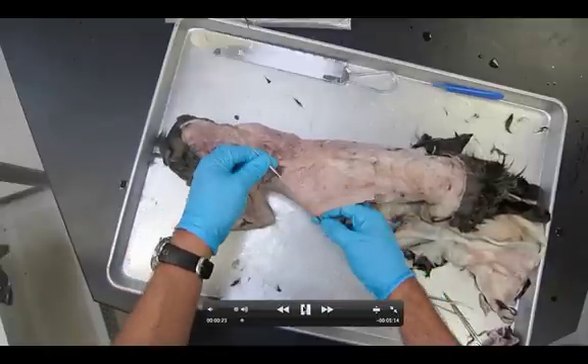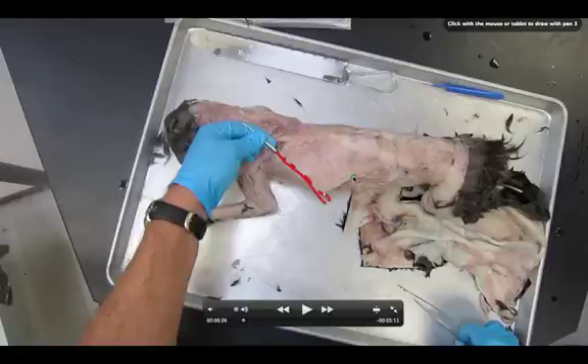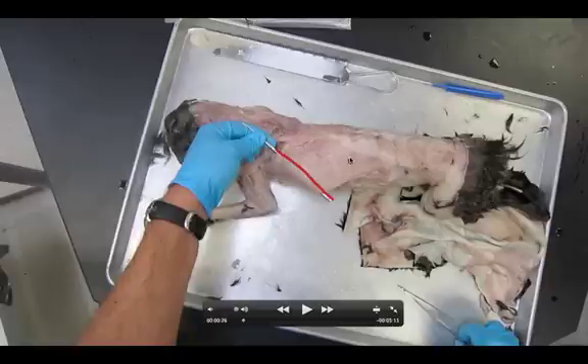First step, get your probe. The probe is going to track the line. I can't stress how important this is — make sure you can see the line we're going to be cutting. A lot of people make the mistake of cutting the wrong direction. Make sure your line goes right along the probe, which is going to be perpendicular to the direction of all the fascicles. We're cutting right across all of those.